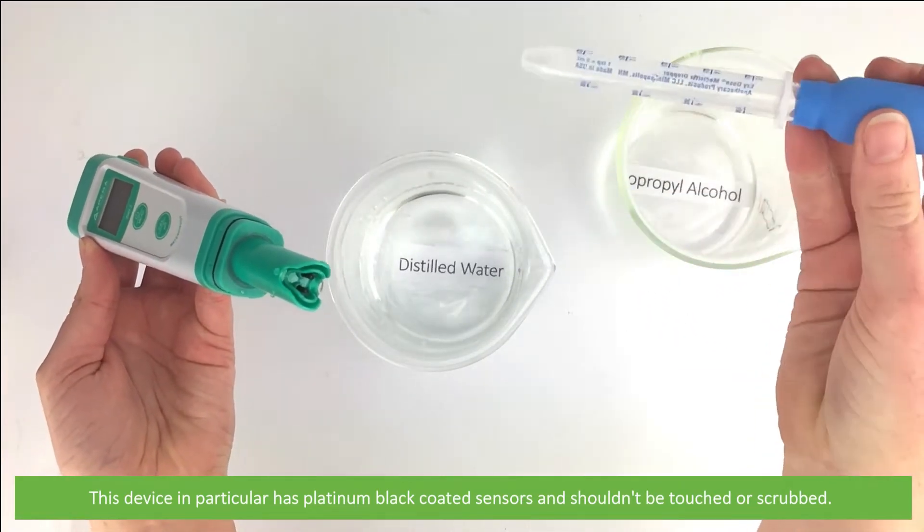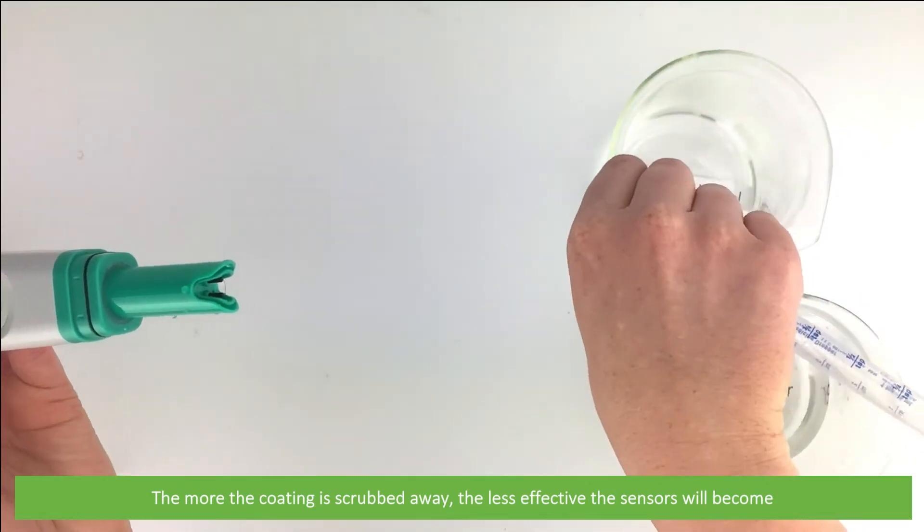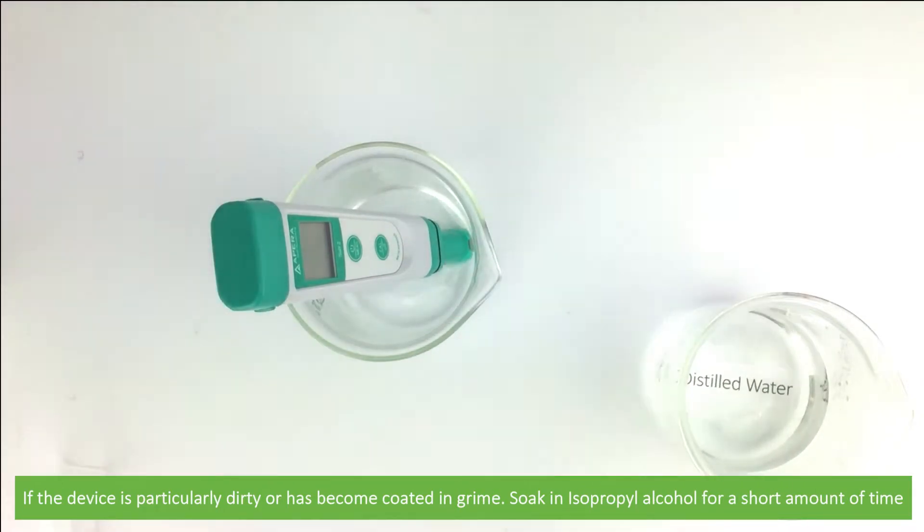These platinum black coated sensors shouldn't be touched or scrubbed. The more of the coating that is scrubbed away, the less effective the sensors will become. If the device is particularly dirty or has become coated in grime, soak it in alcohol for a short amount of time.